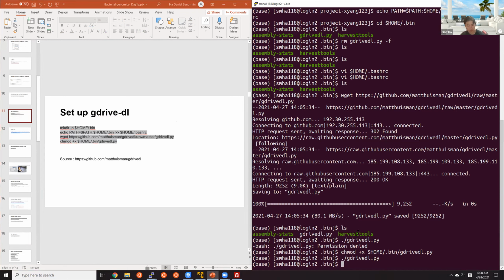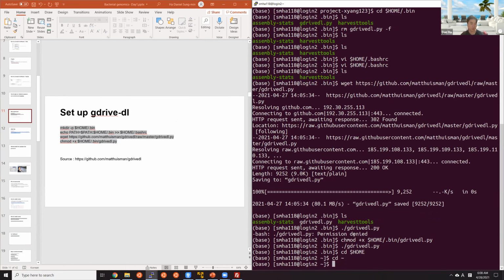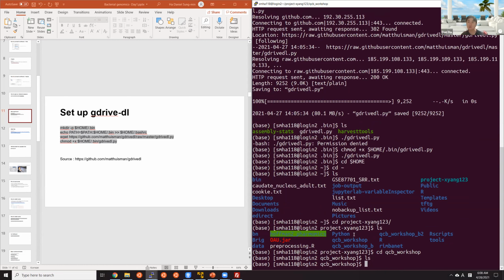Let's go back to our home directory. You can type in either this or this to go to your home directory. We have made the QCB workshop directory there, so go to that directory.